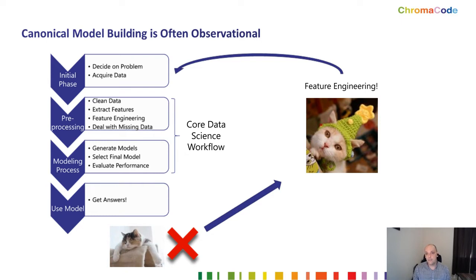Well, in our case, when we design qPCR assays, and in the case for a lot of biotech companies, you're actually creating the chemistry that creates those features. We design TaqMan primers and probes. We design the chemistry, we design the dyes, we design the image algorithms. What we can do is use feature engineering, which actually means a biochemist tweaking some assay or trying to decide, does this need to be brighter, does this need to be dimmer, do I need to switch the dyes out? So we call that literally also feature engineering.